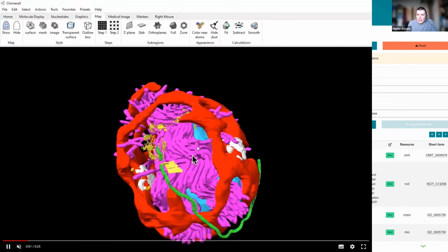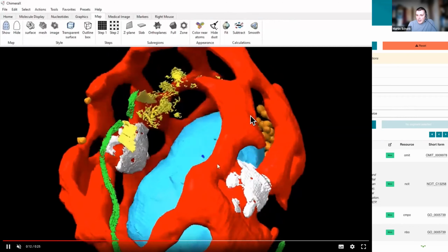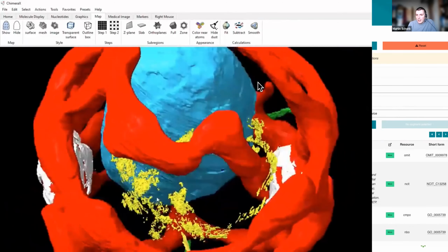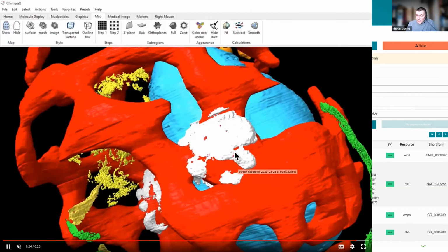What you see on the next slide is a visualization of one of these EMDB segmentation files. It actually contains exactly what we've seen before. You can visualize it in ChimeraX. This is an open source software that's used a lot. It has a very nice 3D rendering, all the fancy stuff where you can put different lighting and everything. So the EMDB segmentation format is now supporting this properly.